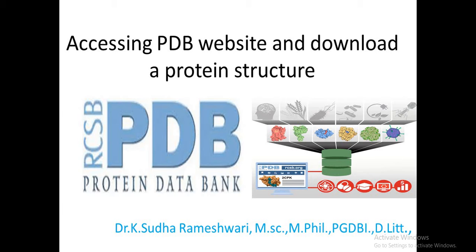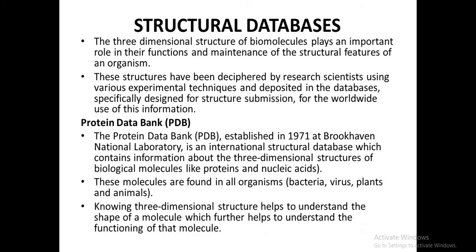Today we will look at accessing the PDB website and downloading a protein structure. PDB is a structural database. The three-dimensional structure of biomolecules plays an important role in their functions and maintenance of structural features of an organism. These structures have been determined by research scientists using various experimental techniques and deposited in databases specially designed for structural information for worldwide use.